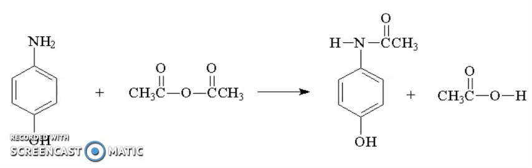This is the way. Another important point I have to discuss here: while decolorizing the para-aminophenol, prepare a buffer solution by dissolving 2.5 gram of sodium acetate trihydrate in 7.5 milliliter of water, which will give you 8.8 ml of solution. Clarify the solution by gravity filtration if necessary.